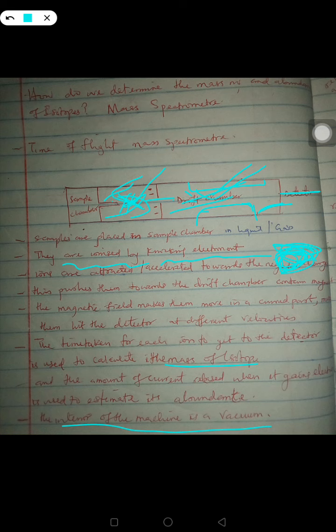Now I have a problem because if there is calcium and nitrogen, my detector will detect nitrogen and also detect calcium. So I will not be able to tell which one is my element. So for purity, number one, the reason the inside is a vacuum is to get a pure, accurate result.